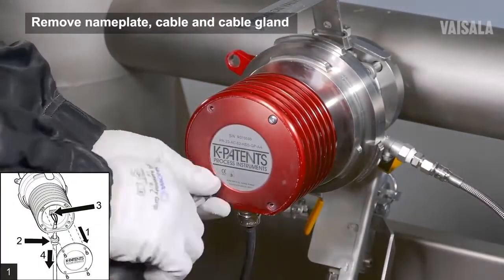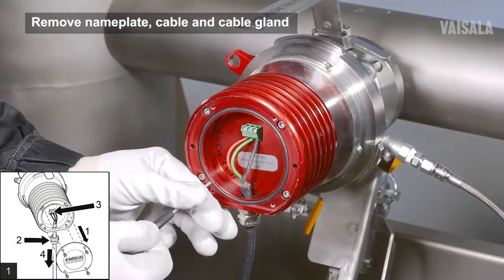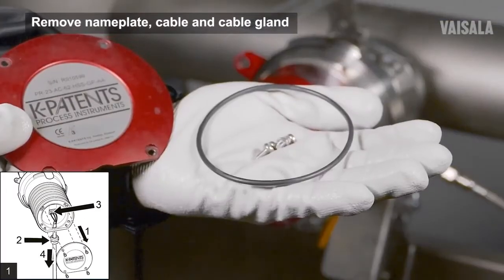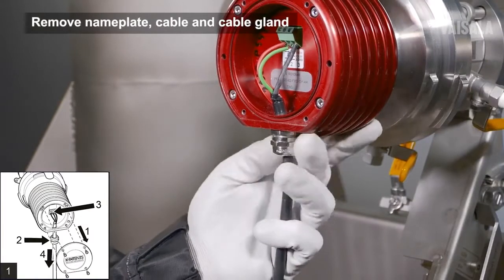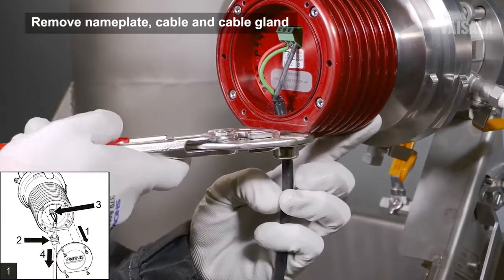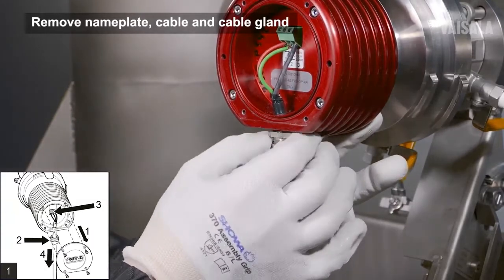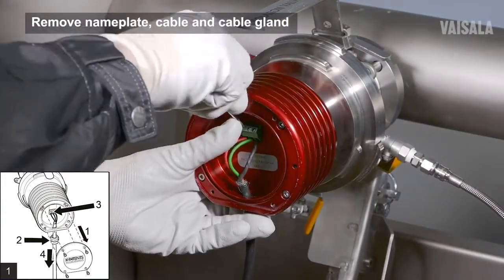Unscrew and remove the sensor nameplate. Loosen the cable gland. Unscrew the wires and remove the sensor cable and cable gland.